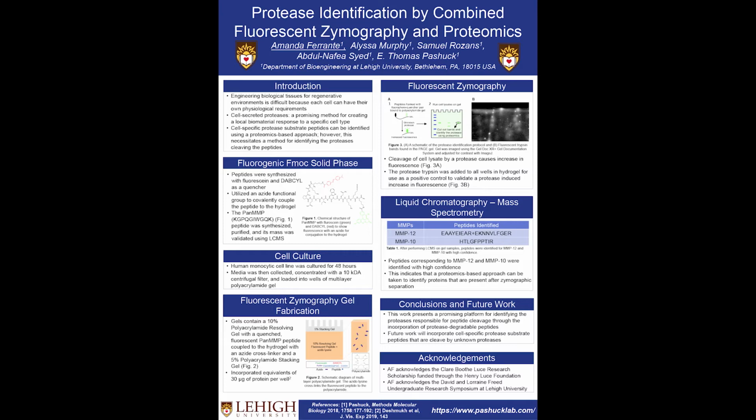I then collected proteins secreted from a human monocytic cell line that was cultured for 48 hours. After I collected this media, I concentrated it using a centrifugal filter. Moving into gel fabrication, the key science behind this involves zymography, which is a protocol commonly used for the separation and visualization of protease activity using standard gel electrophoresis.